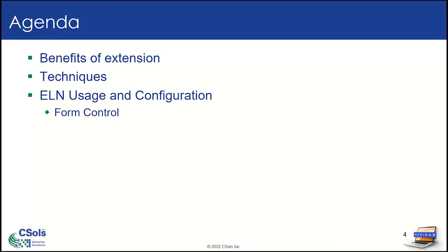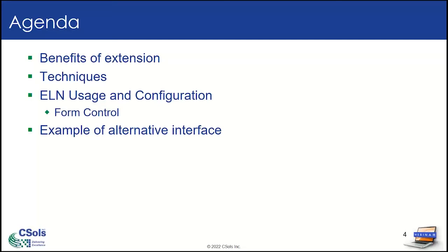As part of this deeper dive into using ELN as your main interface, I will be covering some information about form control and how it can be used. And after all that, even if you decide that you wouldn't want ELN to be your main interface to all of your system functionality, I'll give an example of how it could be used just to replace maybe one particular interface in a way that makes data entry more useful.